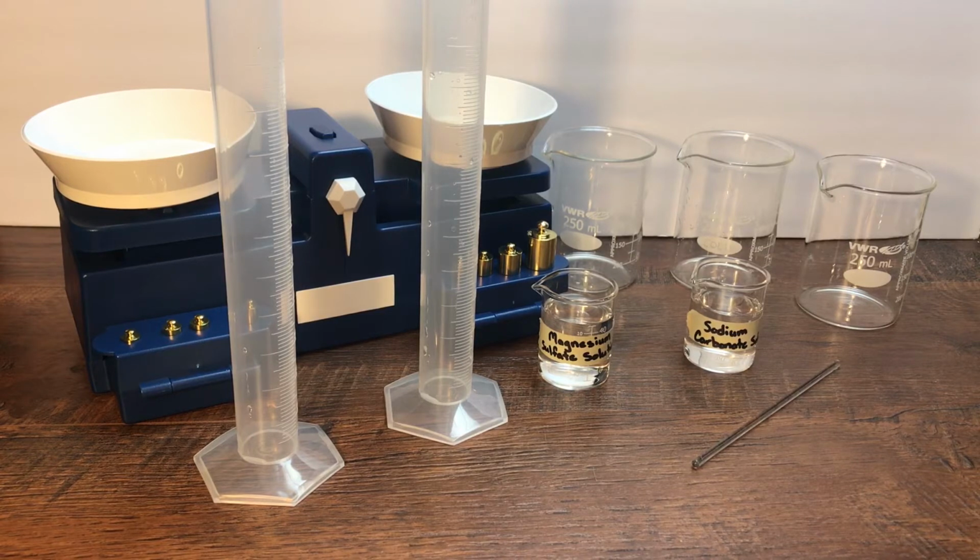In the previous lab, positive reactions, we noticed that two liquids formed a solid. What do you think happened to the mass of the system after they combined? Did the mass change when the solid formed? Let's find out. This is the lab Reapproaching Reactions.